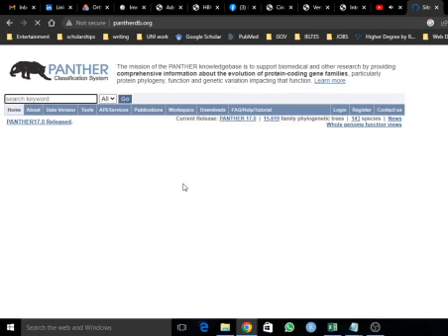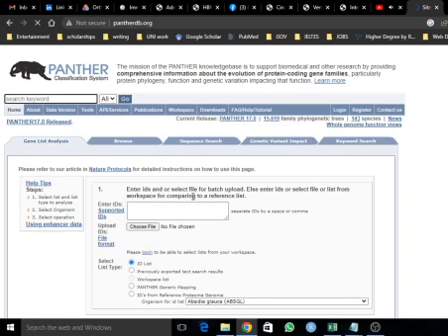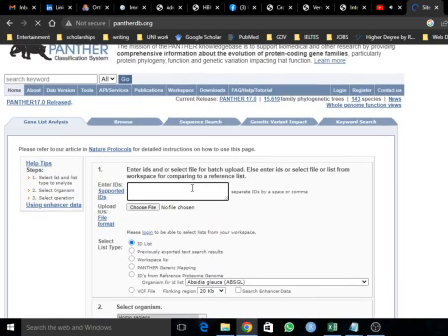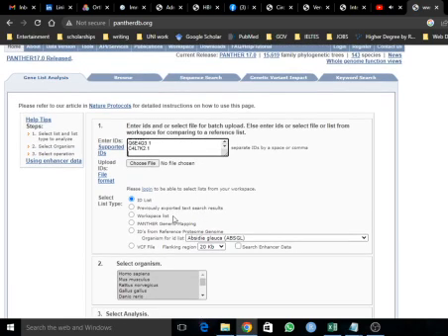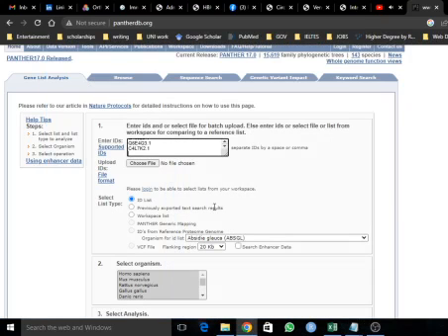It is time consuming because you will be uploading a large amount of data. First of all, upload your data. I'm just pasting my data by pressing Ctrl and V. You can also select a file, for example you can choose this file simply. I just copied my data manually. Then we move to the next section.